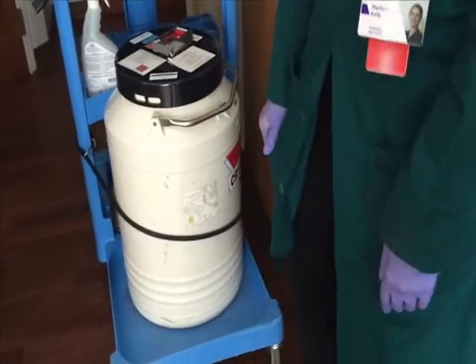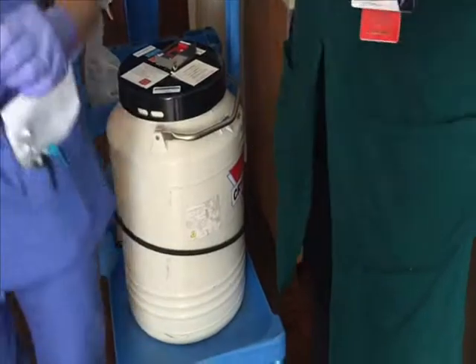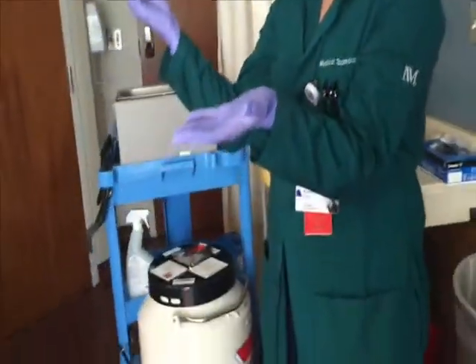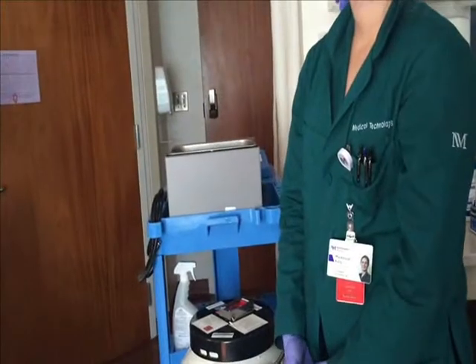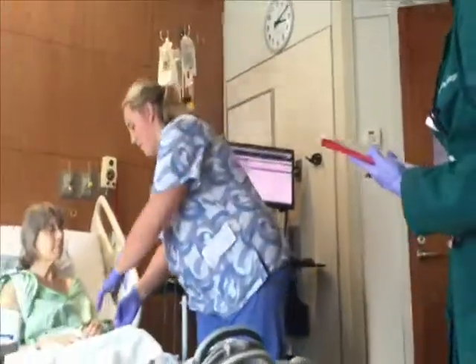How do they freeze them? I mean, what's the process? Is it real slow or real fast? It takes about an hour. We have a controlled rate freezer, actually a small box. It's basically kind of like a fan blowing liquid nitrogen that freezes them solid. We use a lot of liquid nitrogen. I know what I'm doing, I promise.